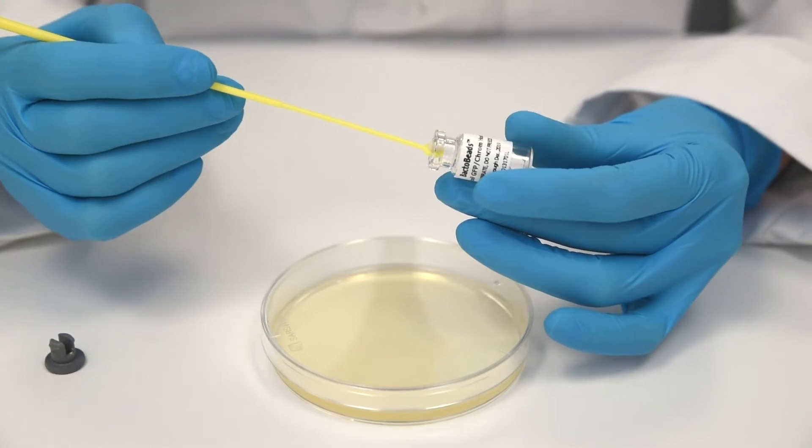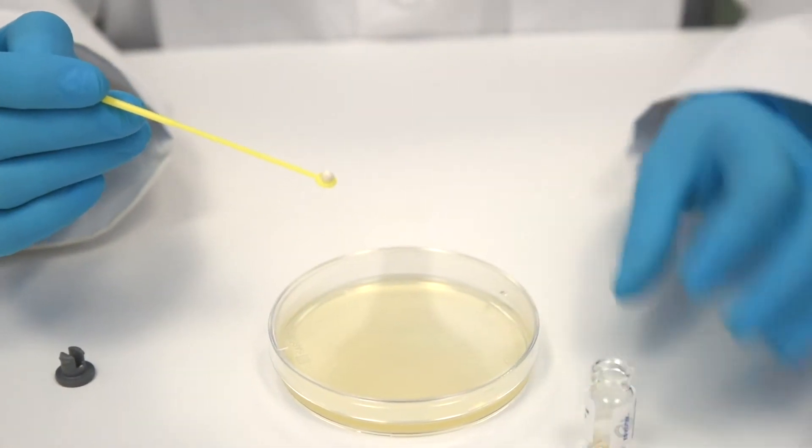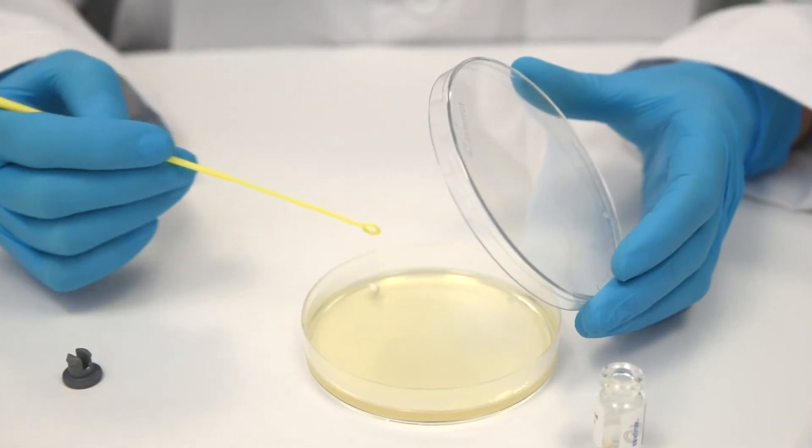Step 8: Repeat the above steps for each of the remaining LB source plates using a new loop for each plate.